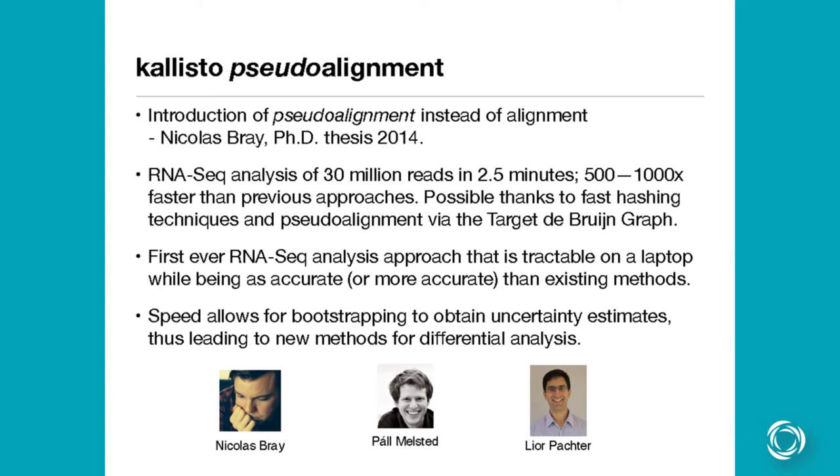That being said, there technically are tools that do reproject back to the genome. I haven't had a chance to clean some of them up so that they can be used with Kallisto, but in principle you can do this. It'll probably take a few days to tinker around with some of the tools. Yeah, I think that's the biggest thing. Really, the genomic reads just offer better visualization. But it takes a bit more work to get a genomic mapping, right? You have many, many more possibilities as well.